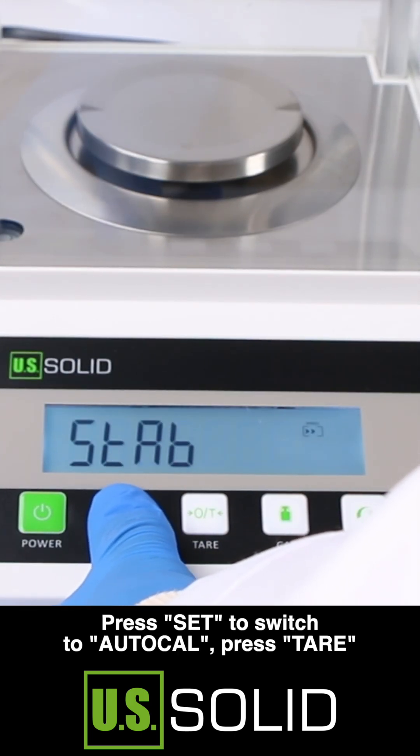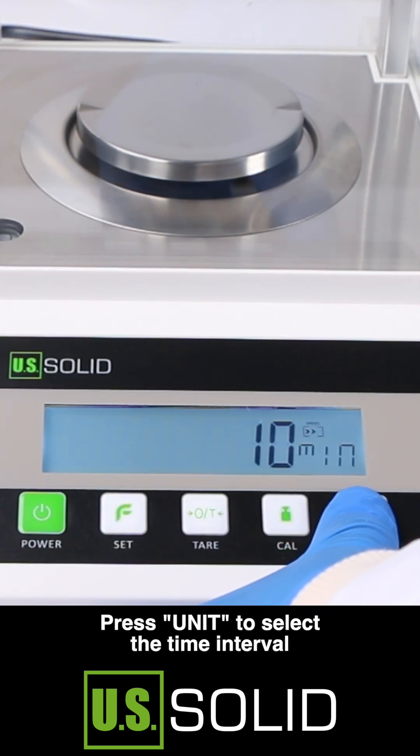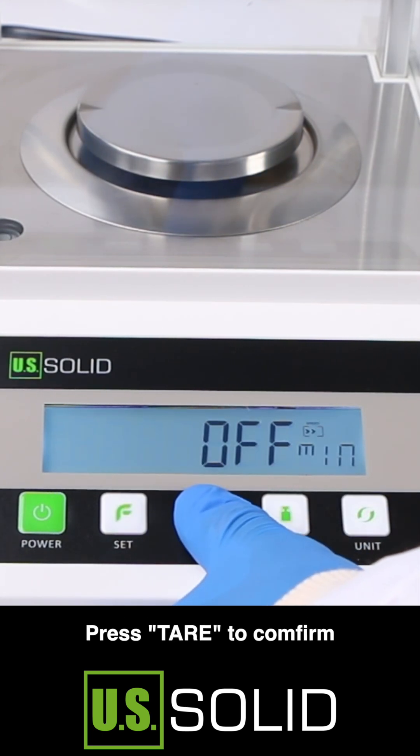Press SET to switch to auto calibration. Press TAR, then press UNIT to select the time interval. Press TAR to confirm.